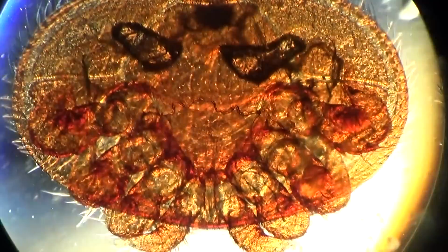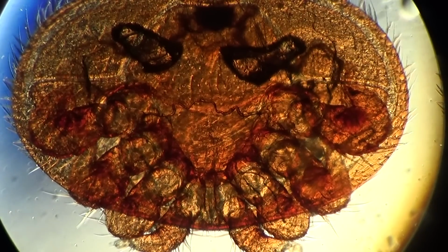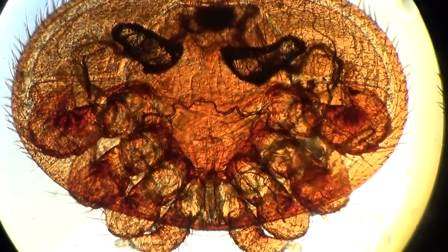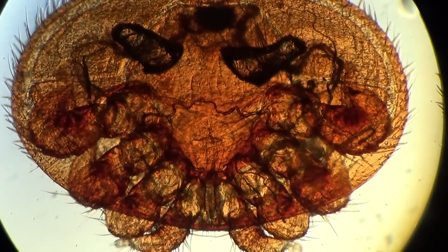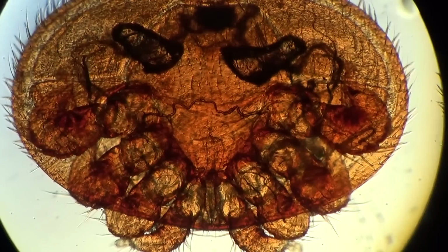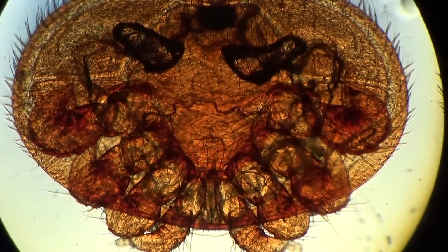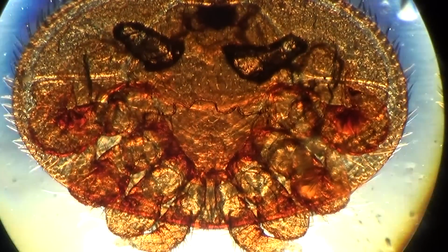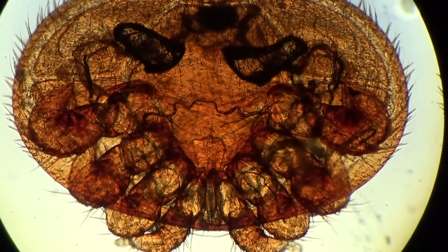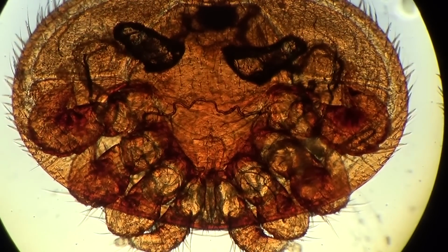And what about the time of development? Under a temperature of 34, the development of the egg will take 2 days, and after that a 6-legged larva is formed, which develops for 2 days and transforms into a protonymph. The protonymph is feeding, and after 3-5 days it transforms to a deutonymph, which is also feeding for 1-2 days and transforms into the adult mite.